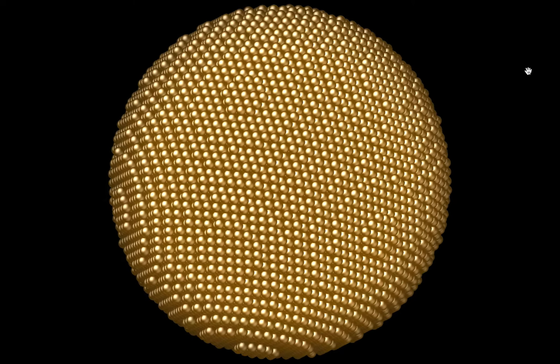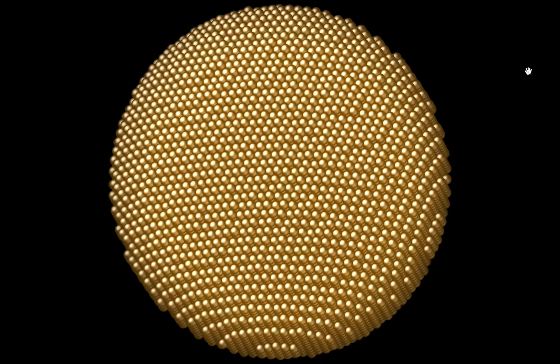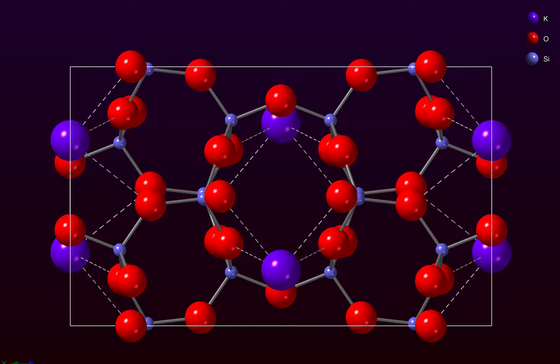Welcome to CrystalMaker 10. In this tutorial we're going to look at ways of generating and displaying clusters of atoms. Let's start with a simpler structure.